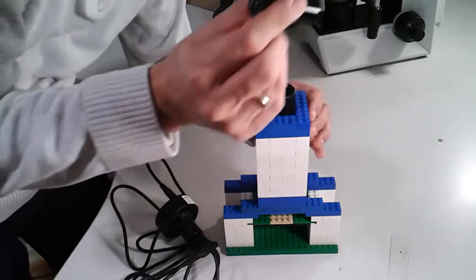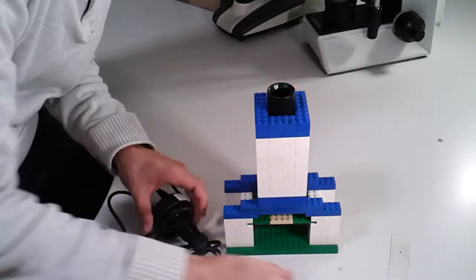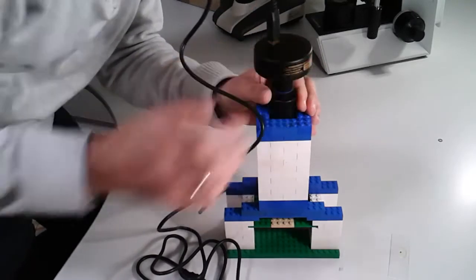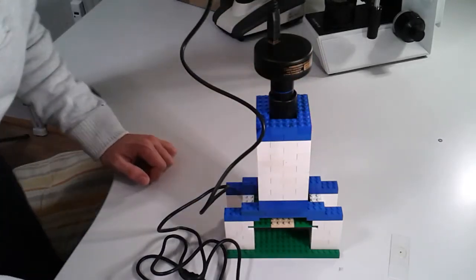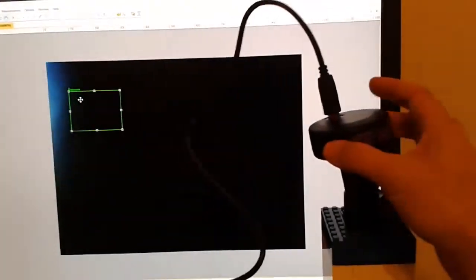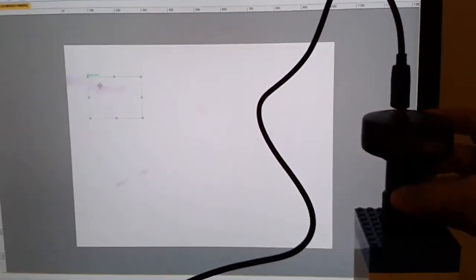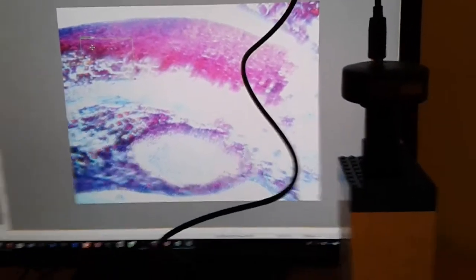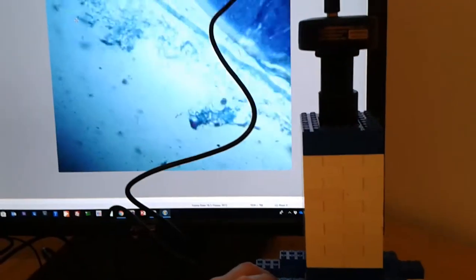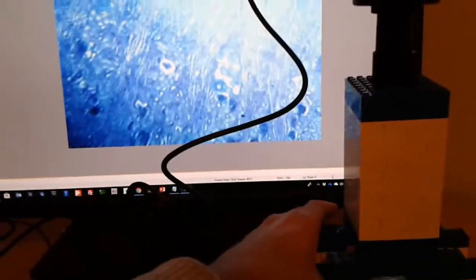If you want to really get carried away, you can take out the eyepiece and insert a USB microscope camera, and then you can watch the pictures on the computer. The camera does wiggle around a little bit and is not very stable, but you can see that it does work. When I exchange the slides, I do not need to refocus a lot. That is the advantage of using a relatively low magnification — the depth of field is much higher and you do not need to refocus.